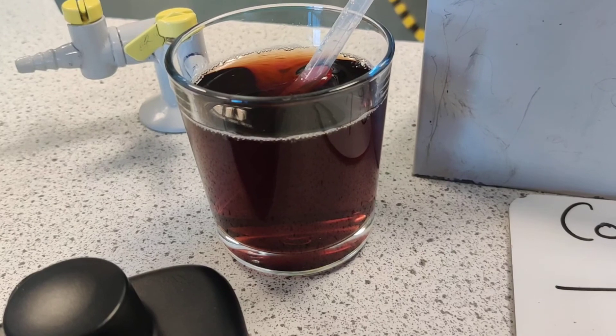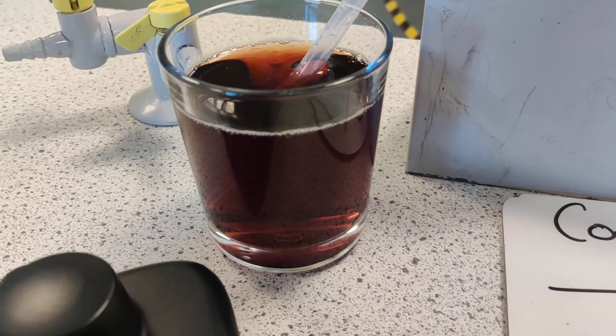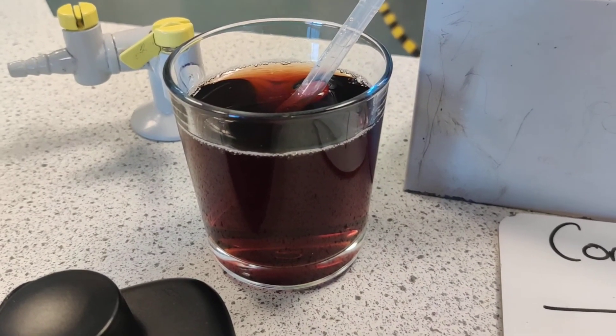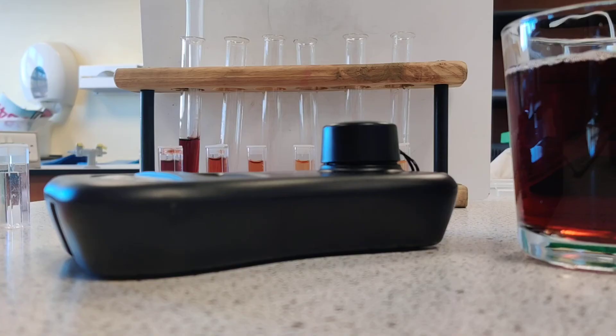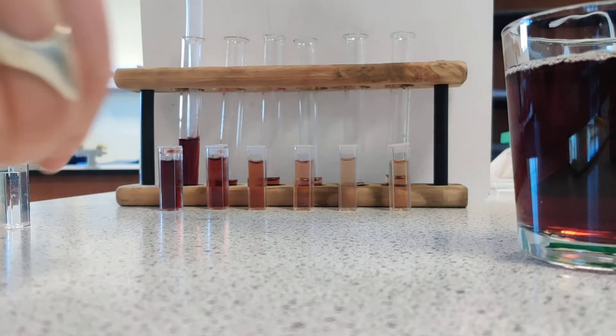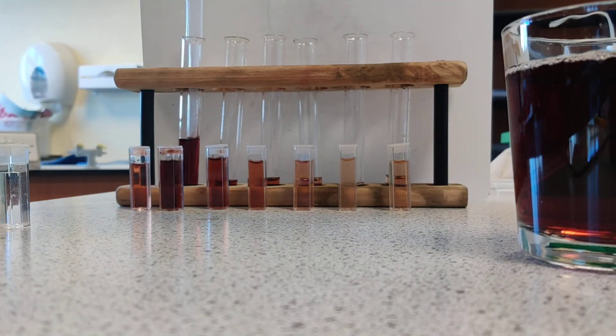Colourimetry is a technique we use as part of BTEC Applied Science Unit 2, which is one of the pieces of coursework we do here at Ryburn. And the last thing we've got to do, as always, is safely tidy up all of our equipment. We always tidy up after ourselves after practicals and put everything neatly away.